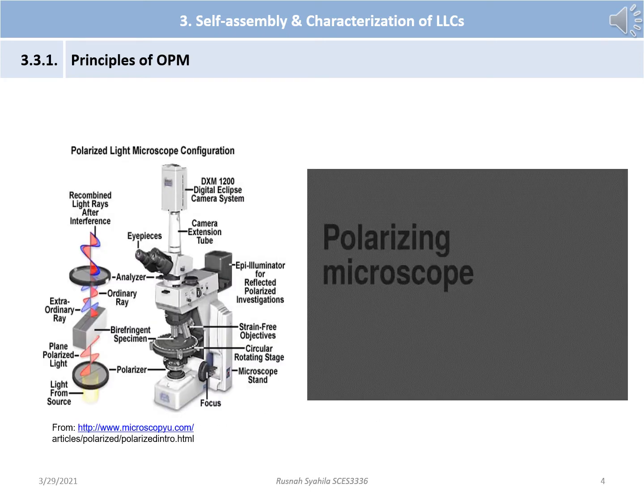Polarized optical microscopy is typically used to detect the existence of liquid crystal phases in a solution. The principle of this corresponds to the polarization of light. Please refer to the diagram on the left side of the slide. In a polarized light microscope, a polarizer intervenes between the light source and the sample. Thus, the light source is converted into plane polarized light before it hits the sample.